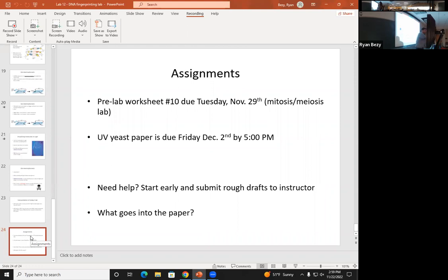That's where you guys can do colony counts, collect your data from last week. It's also your chance, if you have any questions about the paper or other remaining assignments for the semester, to ask those, or even, if you wanted to, you could start working on a little bit of the paper or outlining some stuff and go through that with you as well. Questions about that? Okay. Then I would say start looking at page 78 of your lab manual, go through that, get ready to do the gel electrophoresis.